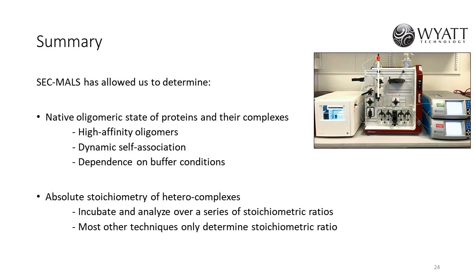So it could only go from dimer to tetramer, hexamer, etc. There isn't a possibility of it being a trimer. The line is in between a dimer and tetramer because these proteins are in constant exchange between these two states, so they're in dynamic equilibrium, and that is why the line increases from dimer to tetramer and is in between. It's a heterogeneous mix.